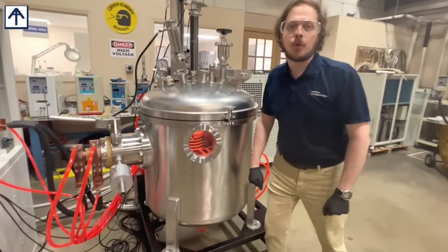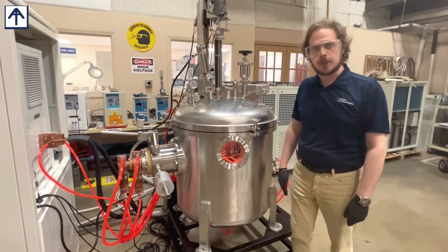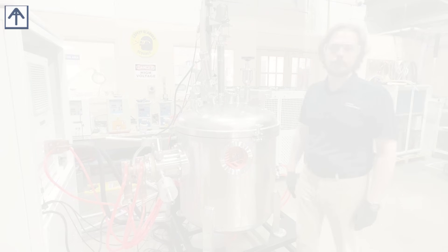We can configure this system for all different volumes and many different materials when you're doing either high-vacuum or inert gas metal work with your induction melting furnace, and you can learn more about these units at our website, acrossinternational.com. Thank you.